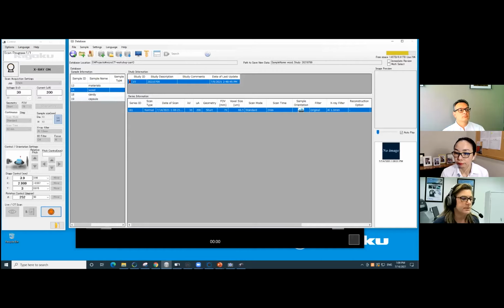All right, so it's mostly finished here. And keep in mind, you're more than welcome to ask any questions throughout while we wait for it to finish. So Angela, we did have a question come in. So obviously we don't know what this one looks like yet, or we have a pretty good idea what it looks like.